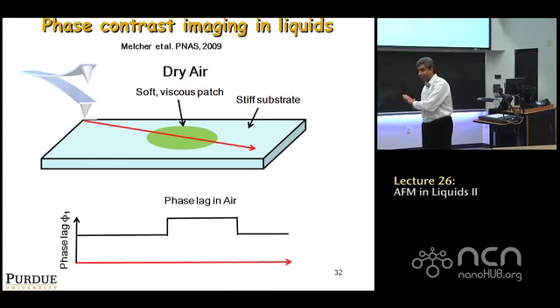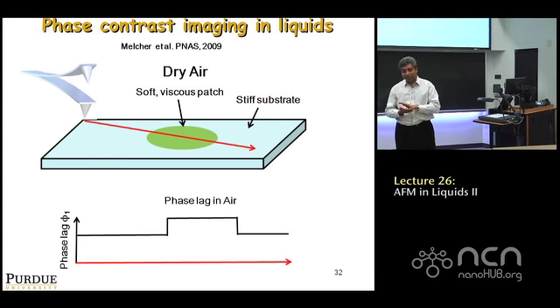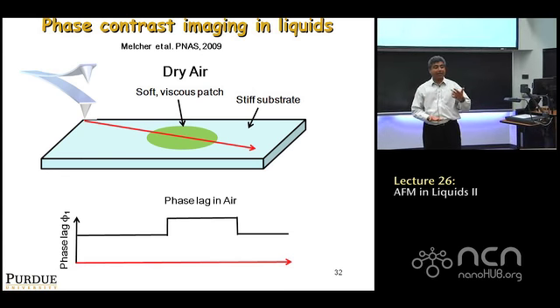On the other hand, I think you've seen already now that in liquid especially, there's a lot of energy loss that goes into ringing or the internal degrees of freedom, right? In fact, you've already seen this simple, hypothetical example, where the interaction forces could be completely conservative and yet you would see an energy loss, because as the ball hits and goes away, you get a pulse and it causes the internal degrees of freedom to ring. And so it doesn't fly back to the same height.